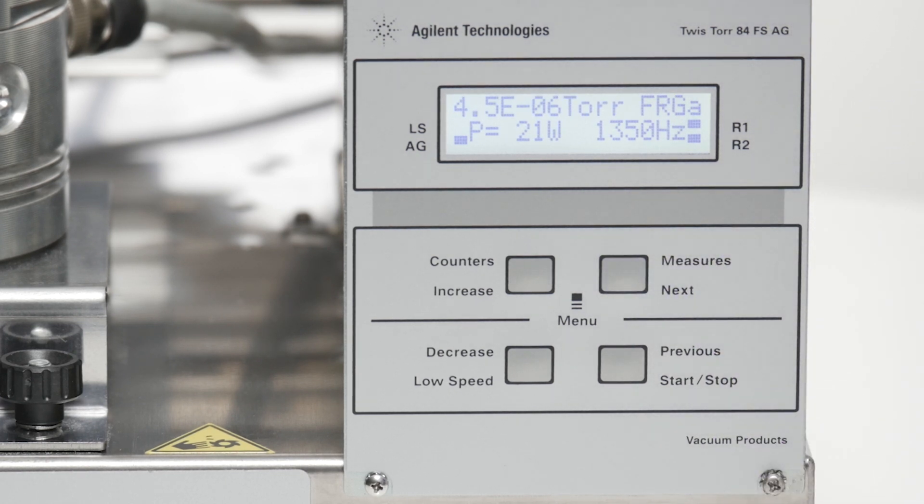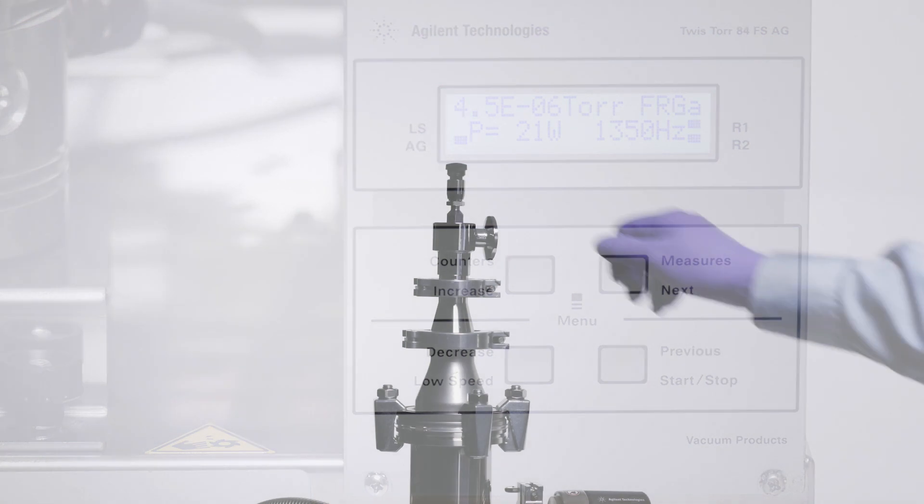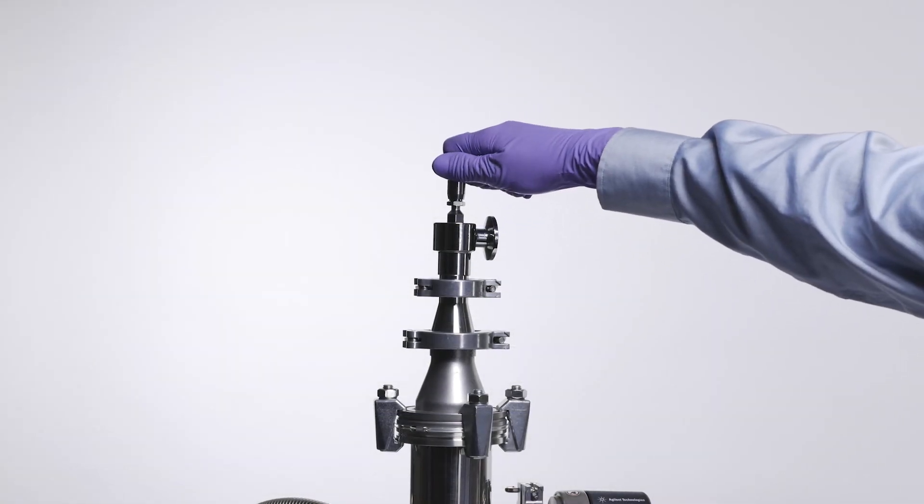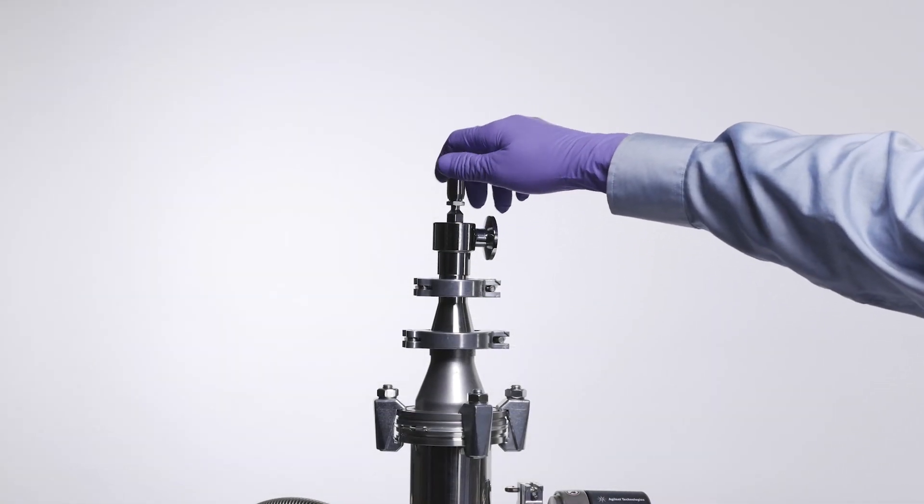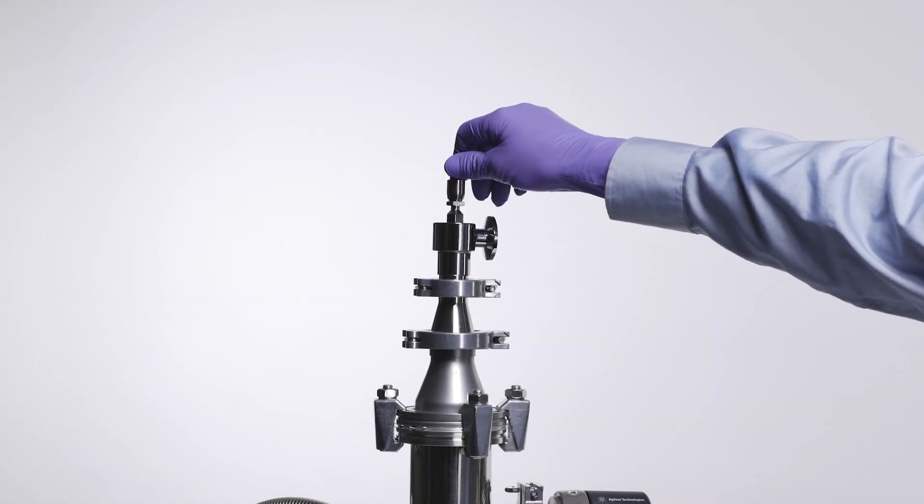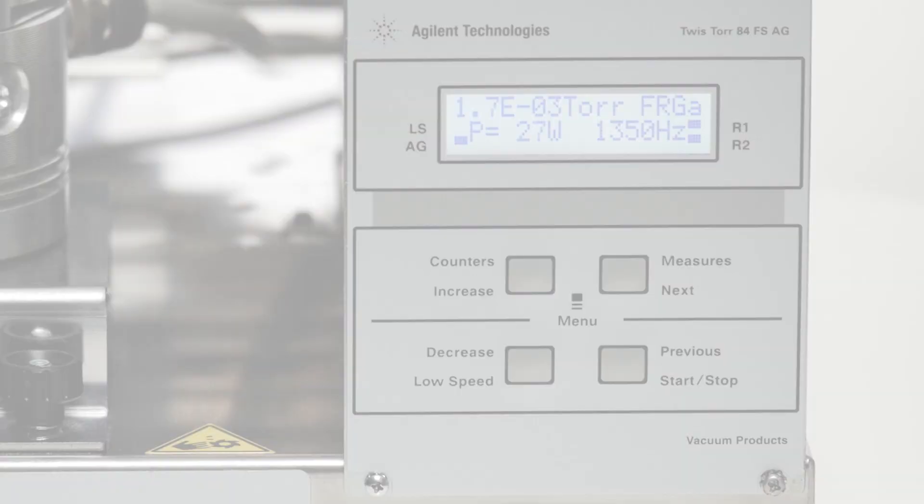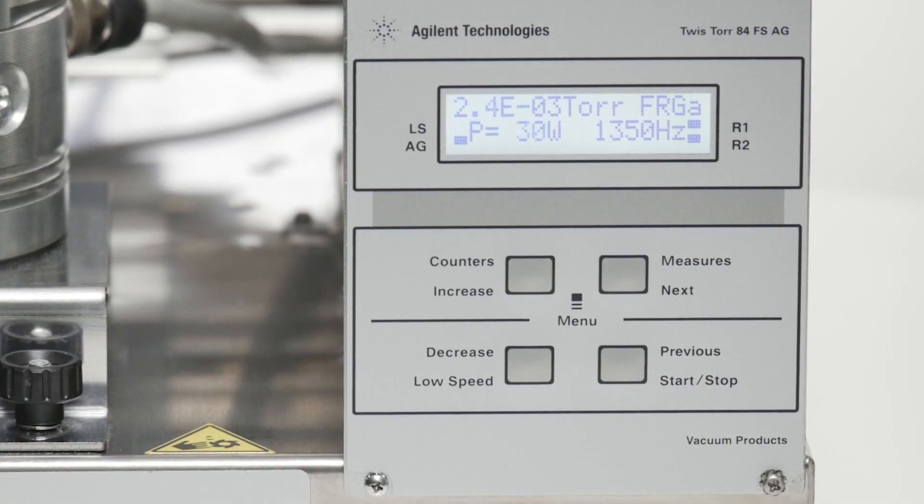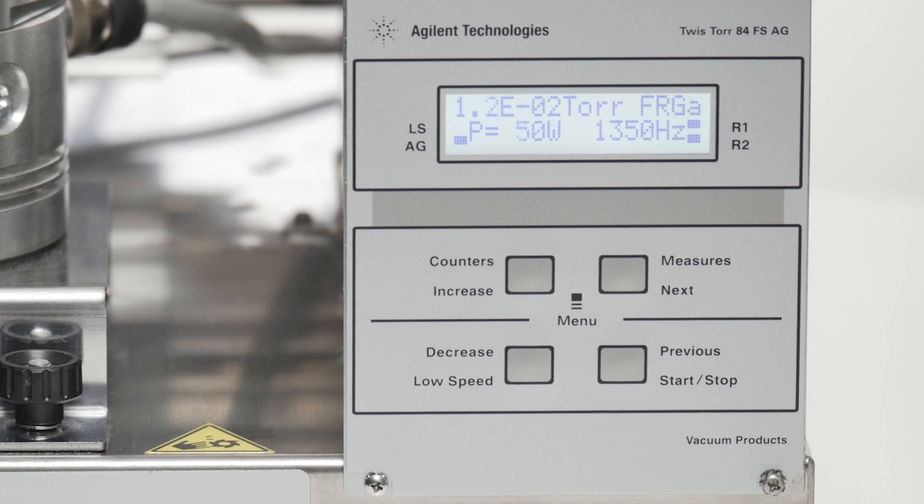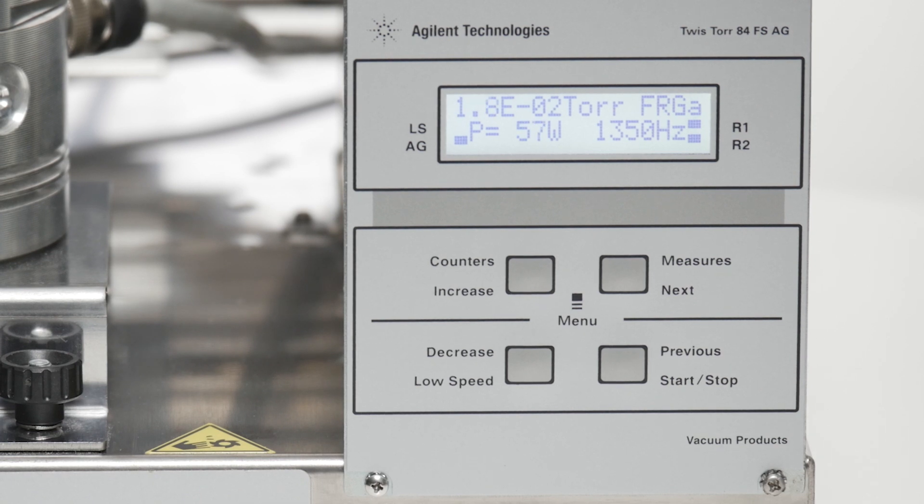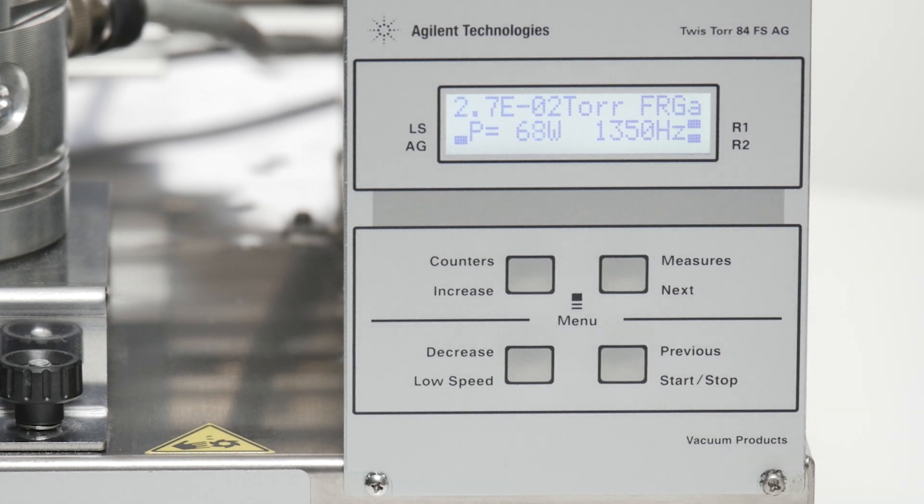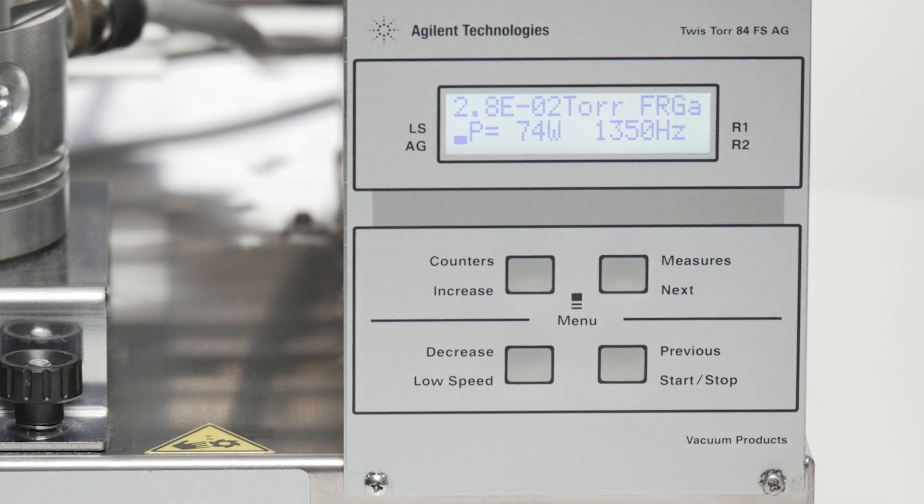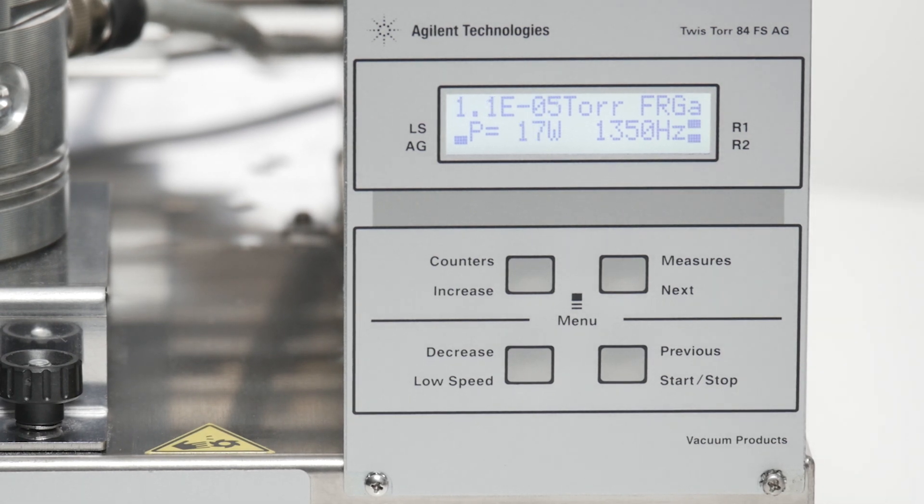As we introduce a gas load, we notice a rise in pressure and power. As gas load decreases, we watch the controller recover back to normal operation.